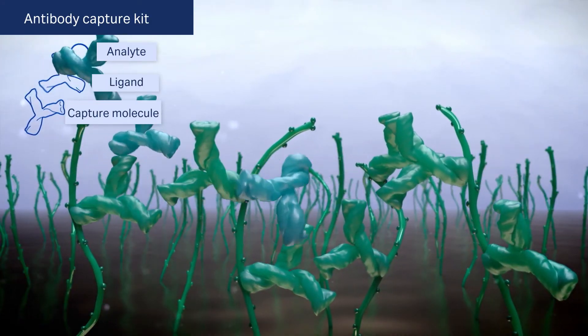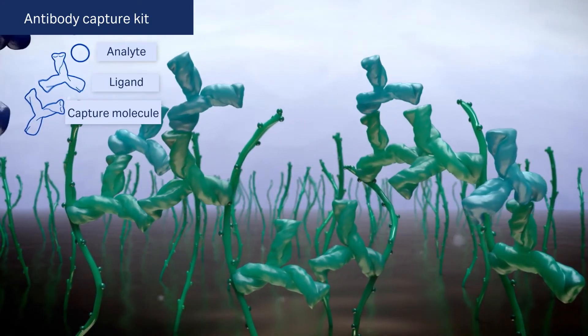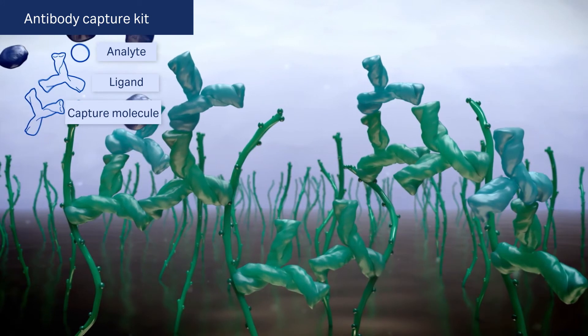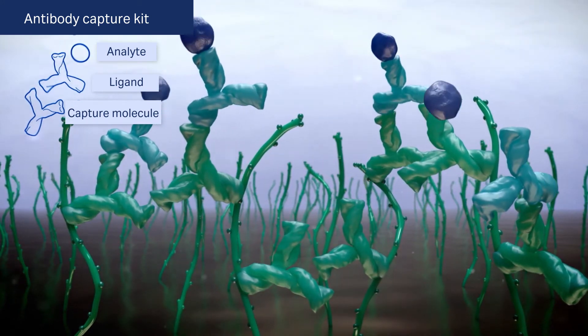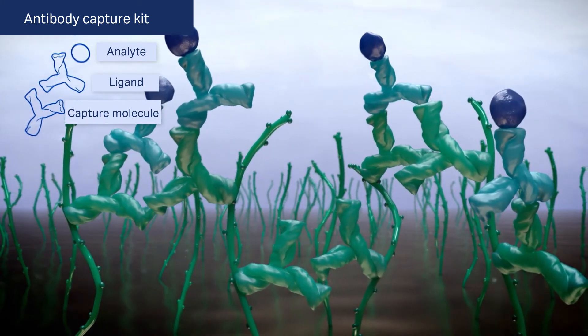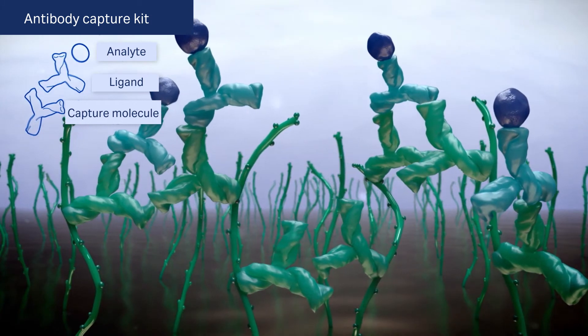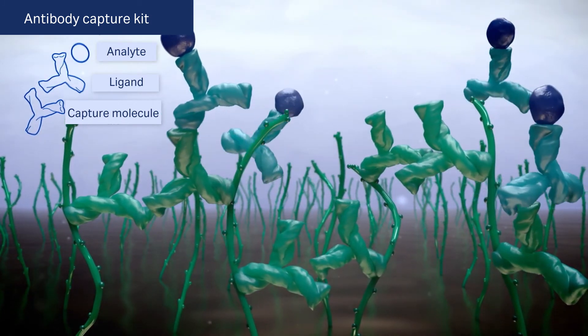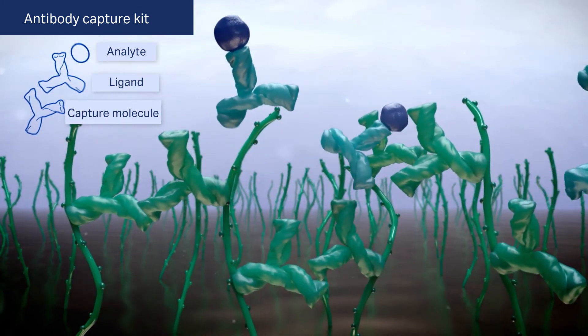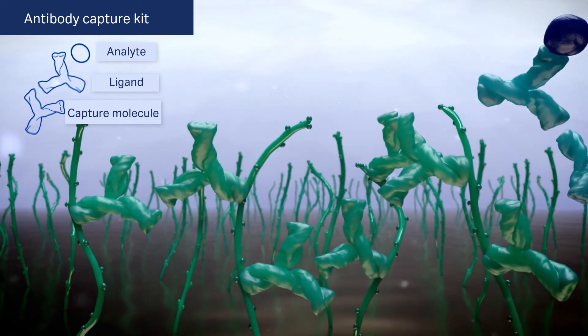Currently, there are three available kits for antibody capture: Human antibody capture kit, mouse antibody capture kit, and human fab capture kit. These capture kits enable orientation specific immobilization of ligand from a complex solution.